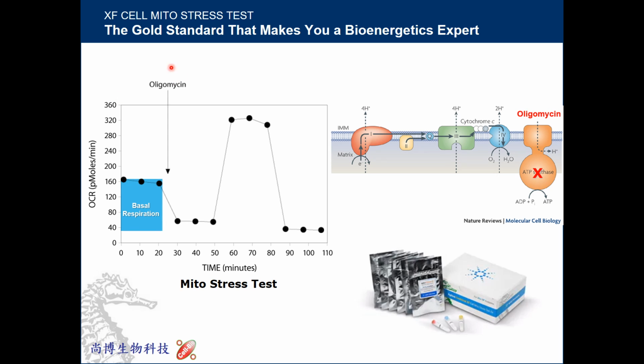The first drug we will inject is oligomycin. It will inhibit the mitochondria ATP synthesis, then you can find your OCR decreased. It means that the oxygen consumption is inhibited, and this oxygen consumption is for ATP production. It is a very important and useful parameter because in a traditional ATP assay kit, you could just know the total ATP production.